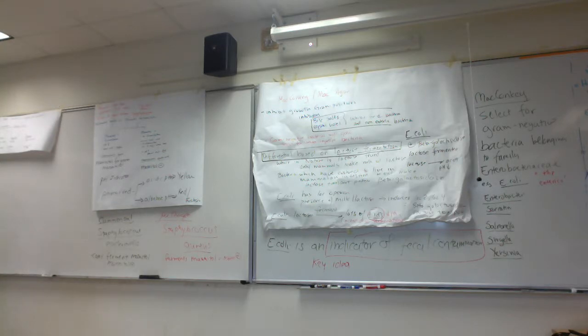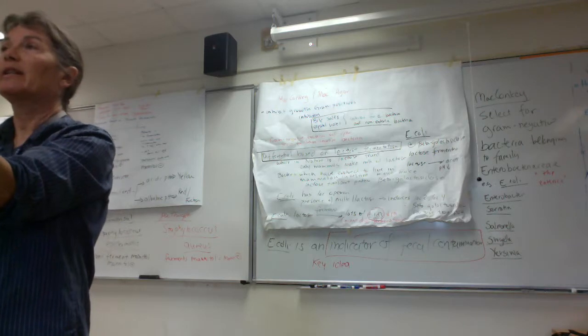What it'll do is it'll tear apart amino acids as an alternate source of carbon and energy. So you guys, when we tear apart amino acids and release the amino group as ammonia, what's going to happen to pH? It's going to go up, right? So remember, you guys, at acidic pH, neutral red is going to be pink or red, and at alkaline pH, it'll be colorless.